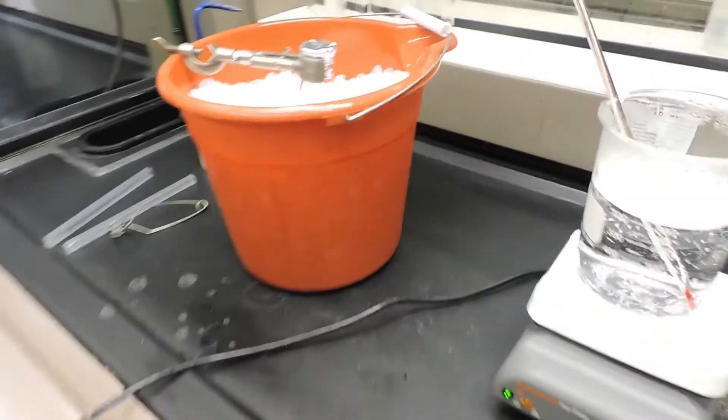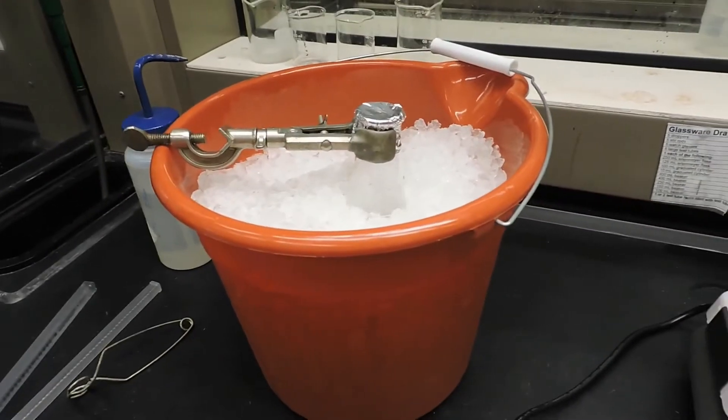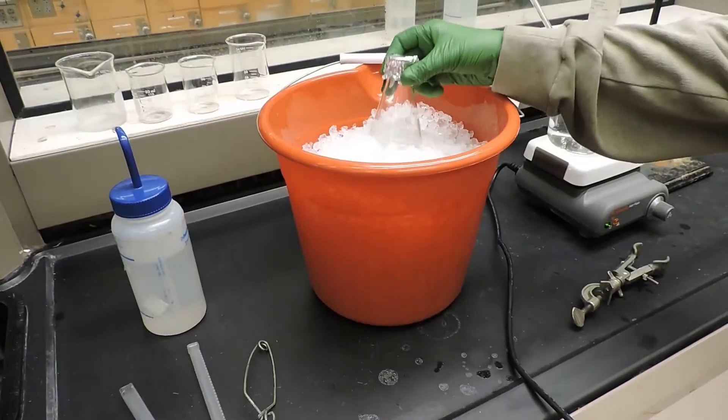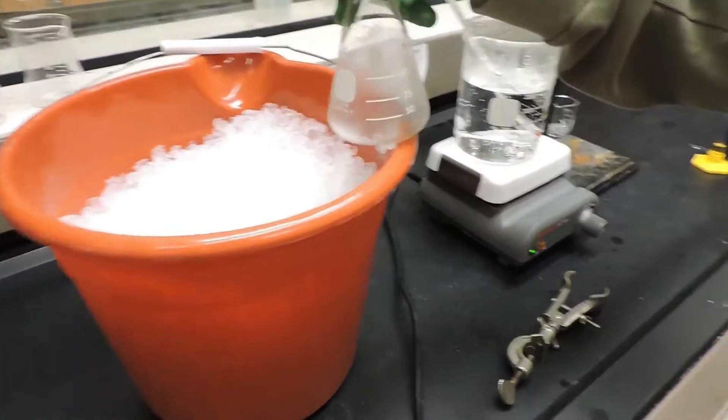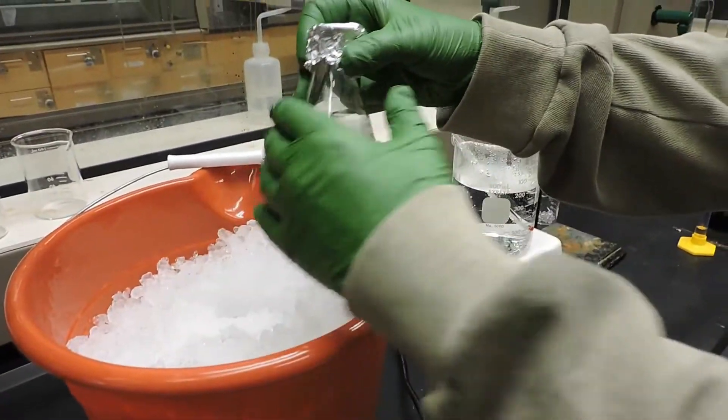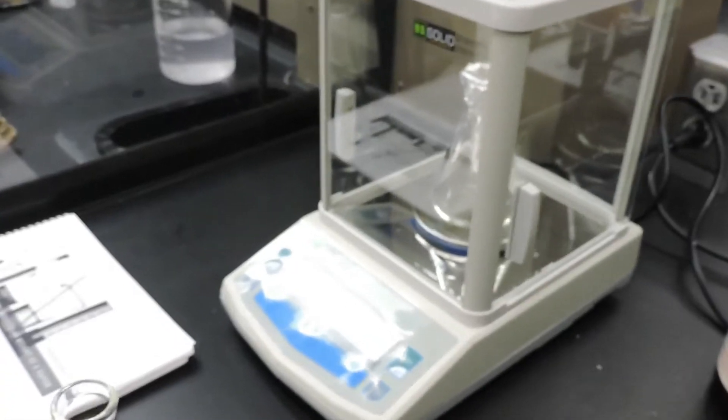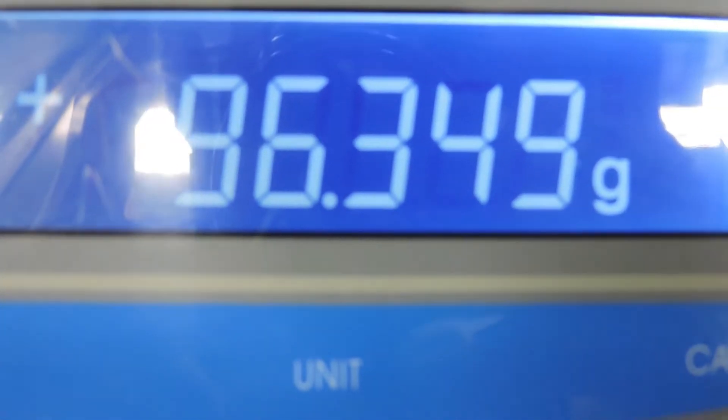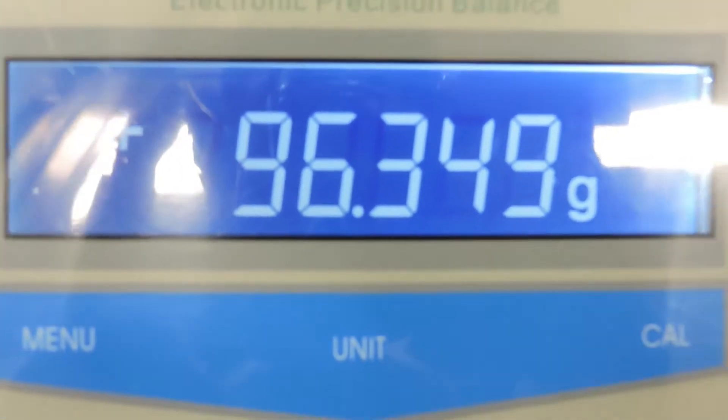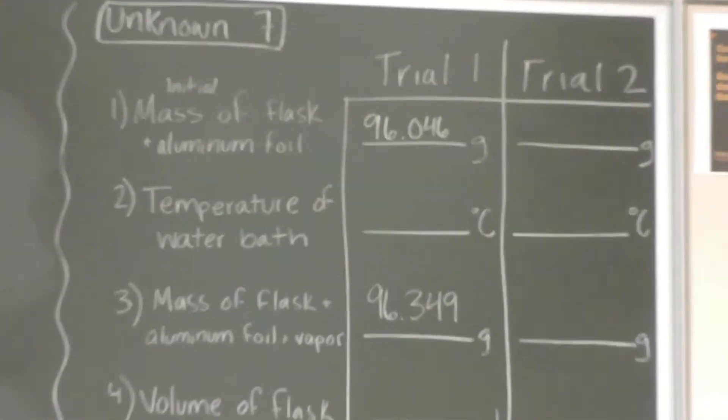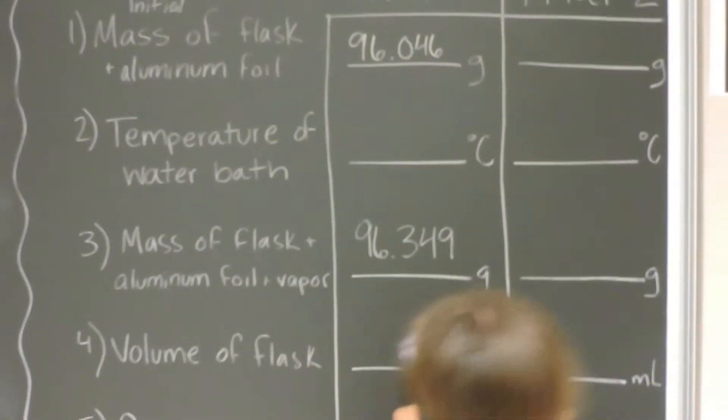Once the vapors have recondensed, we will dry the flask off and then find its mass again. Now that the flask has been sitting on ice for a little bit, the vapors inside have recondensed. We'll dry it off to find its mass, and the final mass is 96.349 grams. Our beginning mass was 96.046 grams, and our final mass is 96.349 grams.